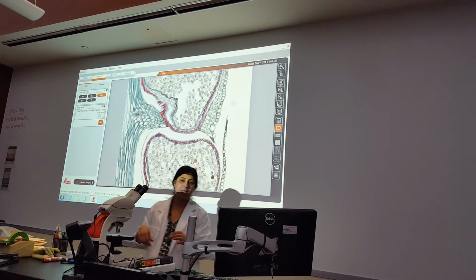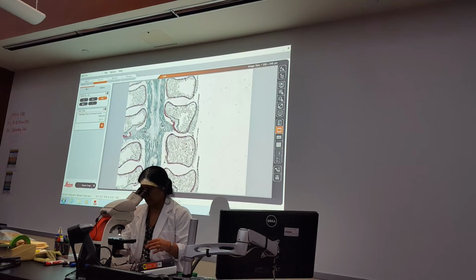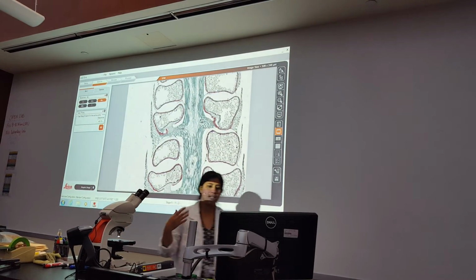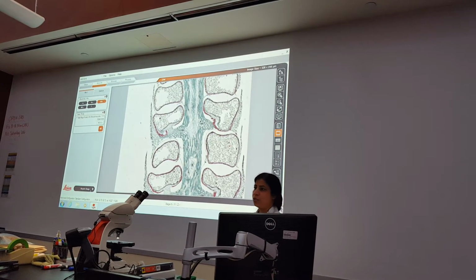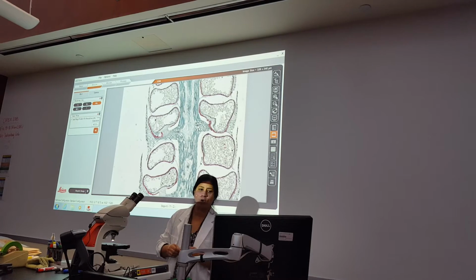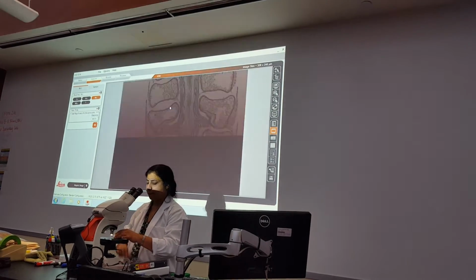You see homosporous? I will zoom in at this level if I want you to really make sense. Look at that. Do you see that all the spores look alike? It's homosporous. So which plant are you looking at if it is homosporous? The Lycopodium.